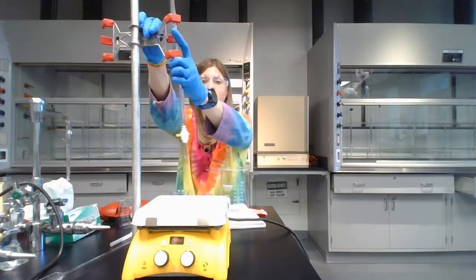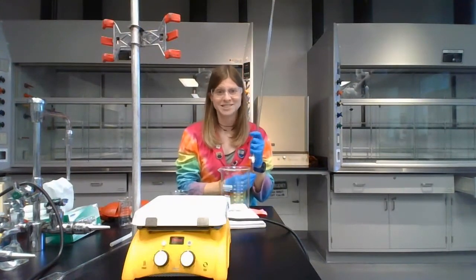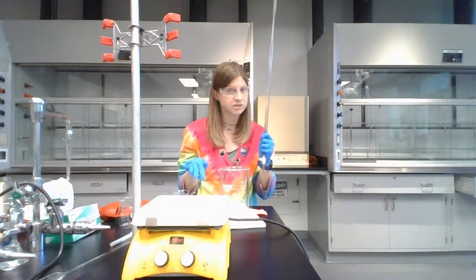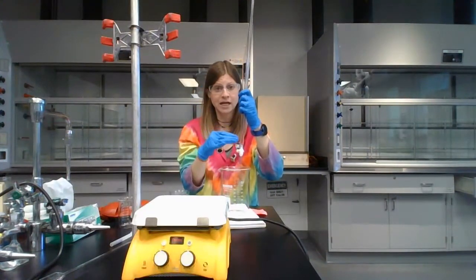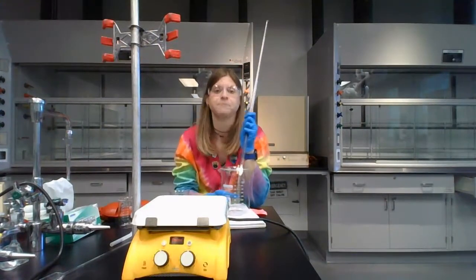So what we need to do, your burette, even once you drain it, is going to be filled with purple potassium permanganate, and we don't want it to stain, and we need to get that out of there. So you're going to take the oxalic acid, which is that chemical that you're supposed to add to any spills, and you're going to rinse your burette with the oxalic acid, so that way all the pure purple potassium permanganate gets rinsed out, and you're going to drain that into the mixture waste beaker.